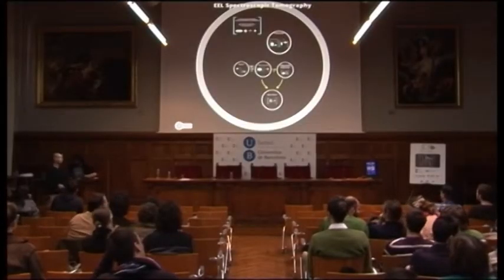So today I'm going to talk about the main topic of my thesis, which is EEL tomography. The idea behind this electron energy loss spectroscopic tomography is to bring together chemical information from EELS, which has already been introduced in the previous talk, and 3D reconstructions from electron tomography.